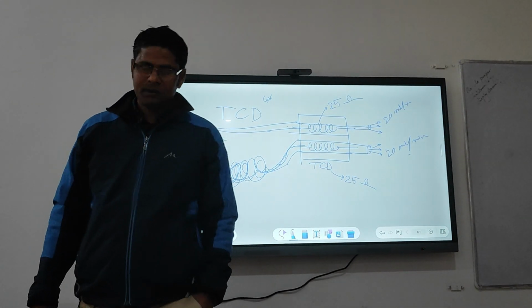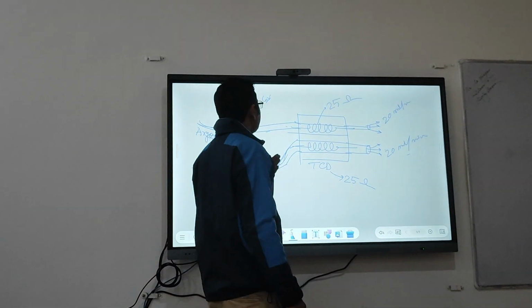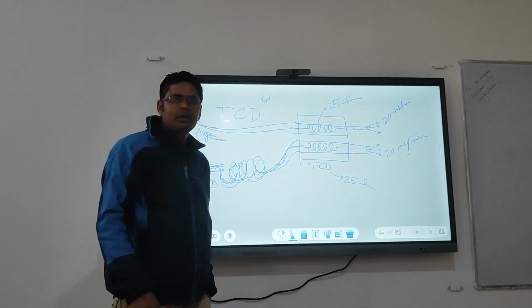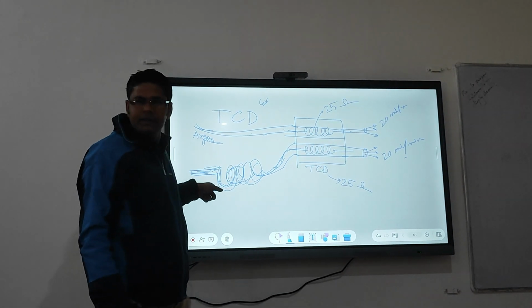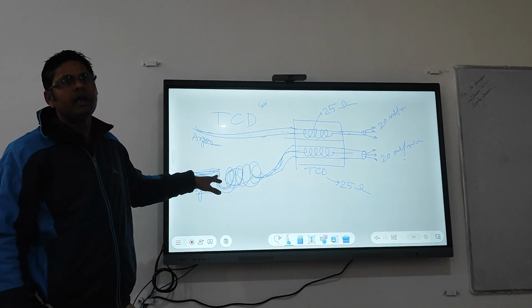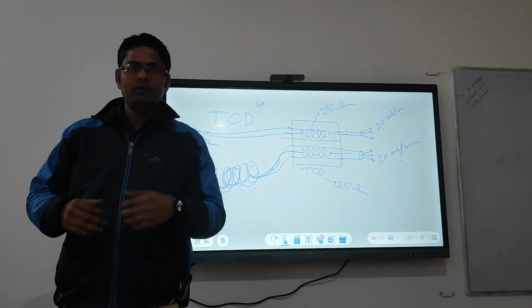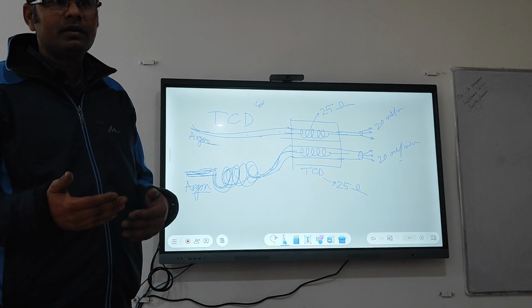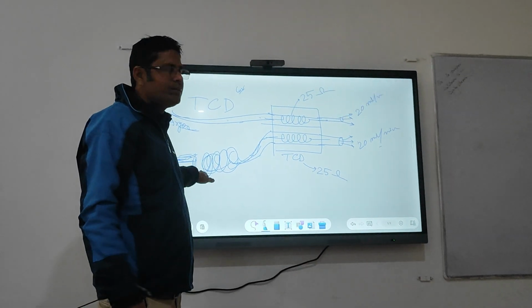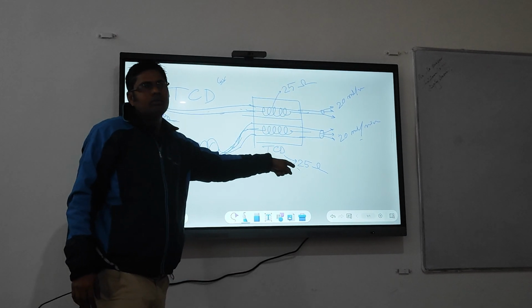Argon has some thermal conductivity, and the thermal conductivity also impacts this resistance. If you change to any other carrier gas, like moving from argon to helium, this resistance value will change due to the different thermal conductivity. Helium's thermal conductivity is different from argon's. So if your carrier gas thermal conductivity changes, this value also will change.